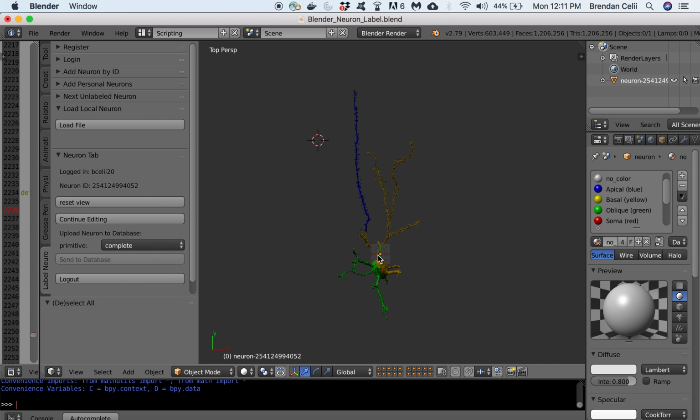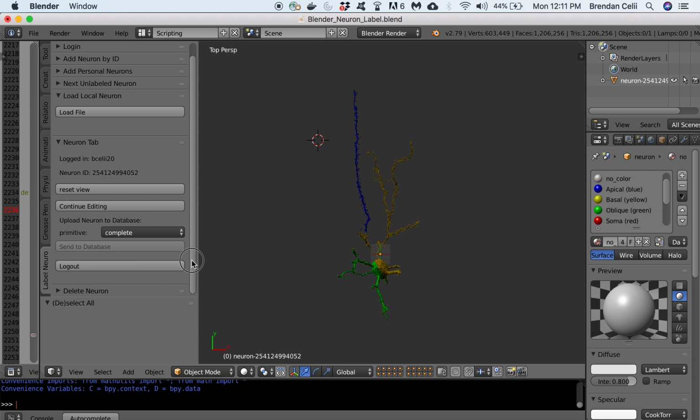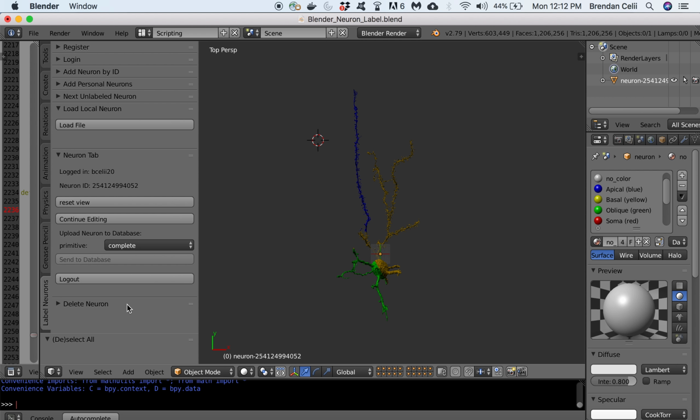And there you go. That is exactly what we labeled, and that's a local copy, okay? So you could, if you wanted to, load up your local copy again, edit it, and then send it to the database by hitting the save button. Or you could just check it, okay? So we should check it's there. So say we just wanted to check it's there. We don't want to save it.